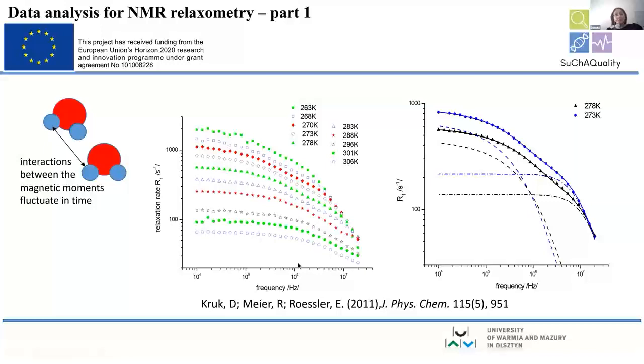Now, okay. And here you have relaxation rates and reciprocal relaxation times at different resonance frequencies. It means different magnetic fields. So the curves usually look in such a way. Here you have an example of some analysis. We'll come to that. You see that one can fit the curves nicely, decompose into something. So it means that there is some science behind, and maybe one could get some useful information from that.